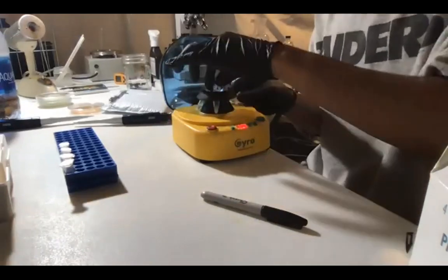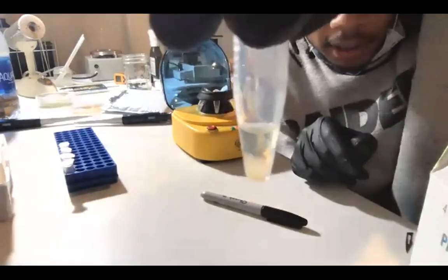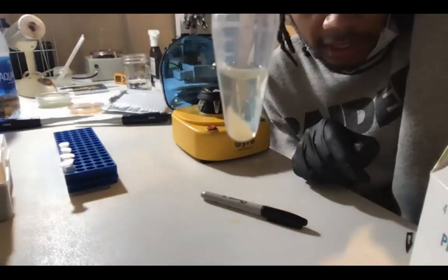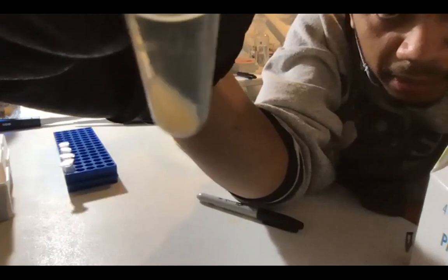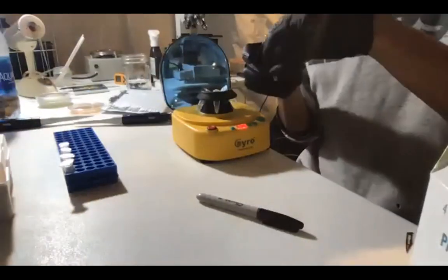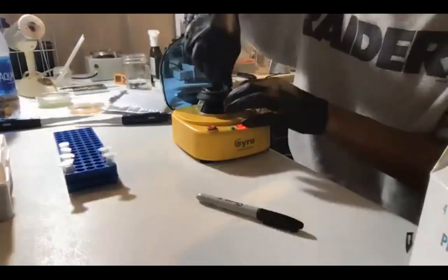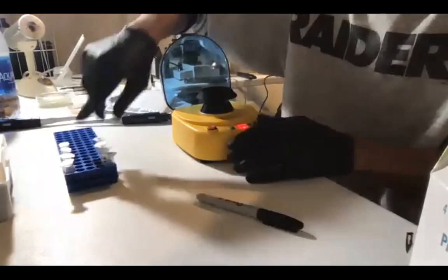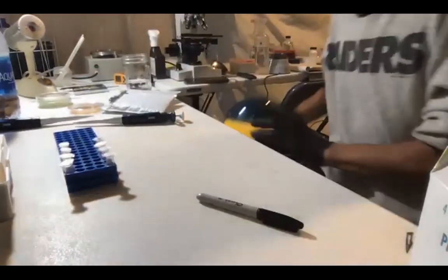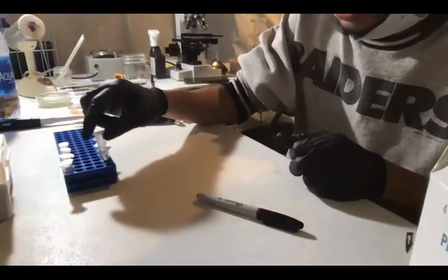So the reason that we put it through the centrifuge is to separate the little bit of agar and mycelium from the liquid that has the DNA extract in it. So you can see there's a little pellet at the bottom. We don't want that mixing in with the liquid. We want only that liquid. That liquid has the DNA in solution. You only need 1 microliter of this stuff per reaction.